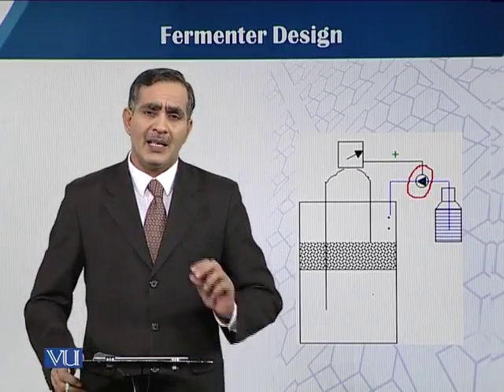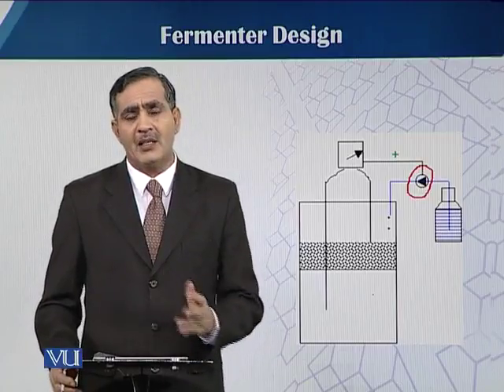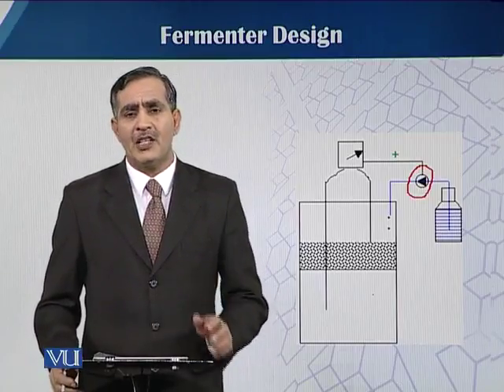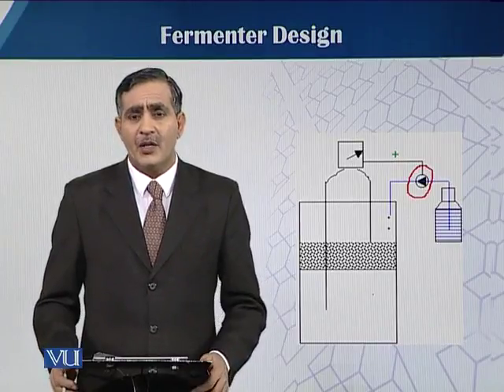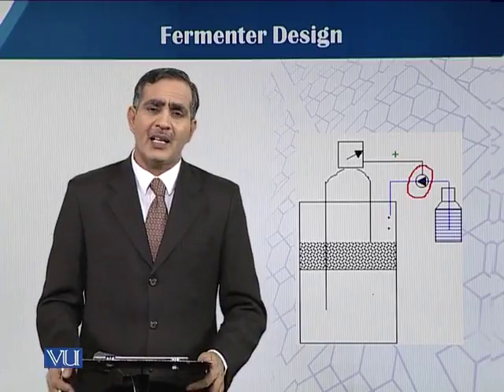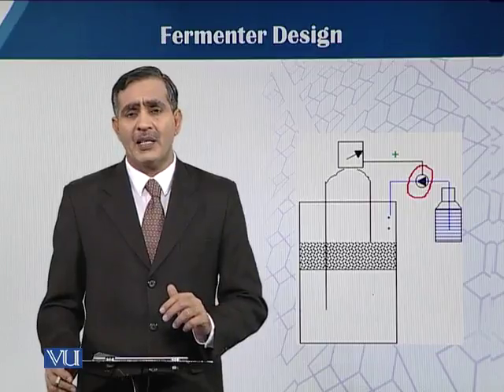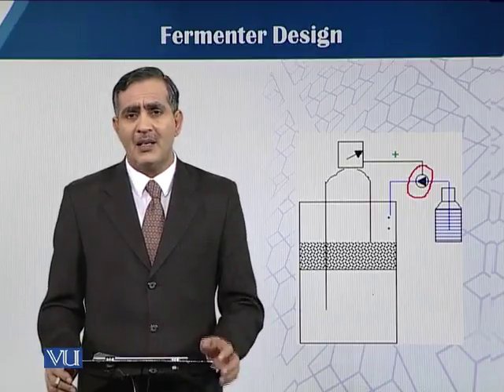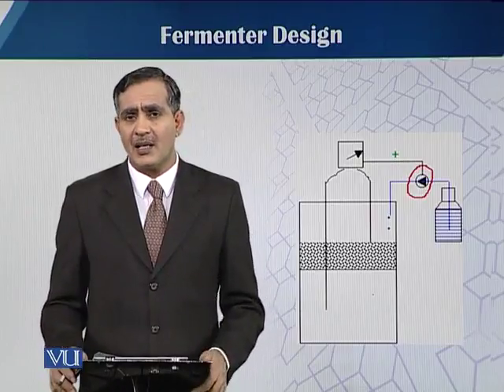They give a wrong signal to the pump, by which the anti-foam addition becomes a constant process. So we have to be very careful in such cases when there is evaporation and wet-on or wet-off conditions, because vapors touching the probe give wrong signaling.